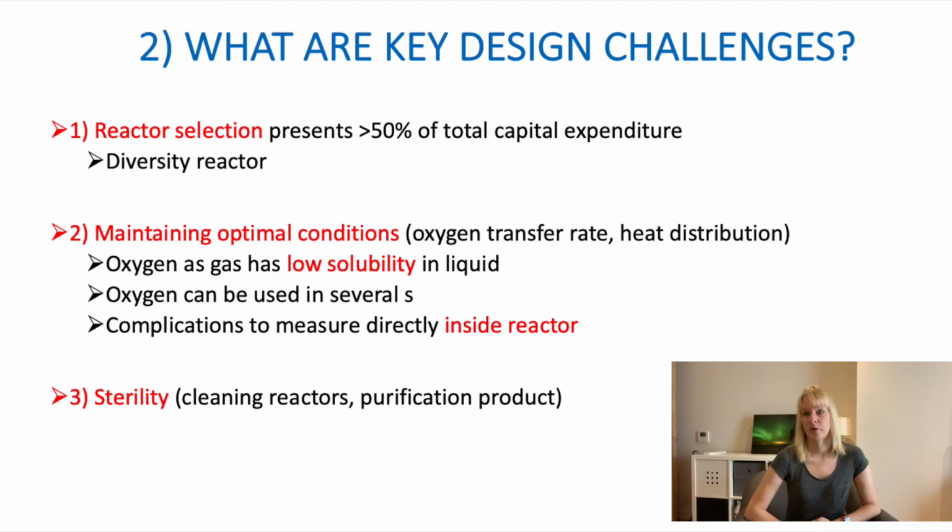Now, there's also a third aspect to this, and this is sterility. If you have your tanks, I think we all nowadays know how important it is to actually clean surfaces. So cleaning between different batches is not an easy task. You really need to make sure that you have the appropriate conditions that you're working with. Especially when you're operating in continuous mode, this can cause some problems, because as you go along, these bacteria might mutate. So you can get development of resistant strains, and some of these strains might not produce the protein that you want. So sterility is a very important factor as well.